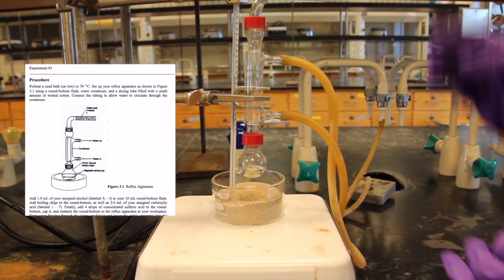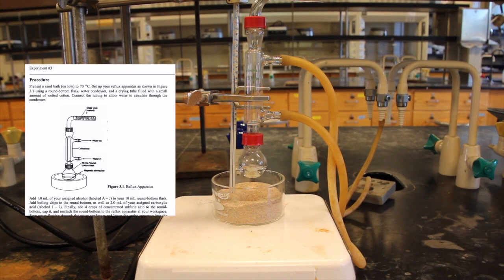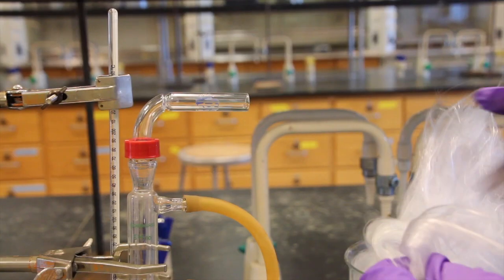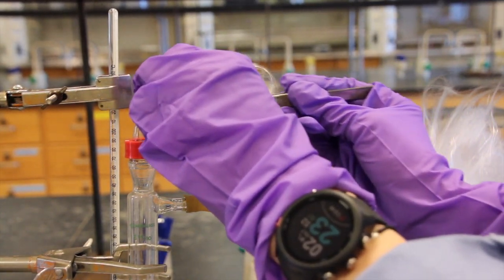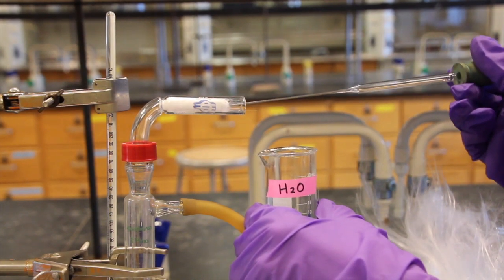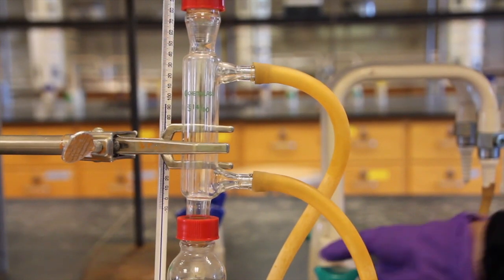To begin your synthesis, preheat a sand bath to 70 degrees Celsius. Set up your reflux apparatus as shown in your lab manual, using a round-bottom flask, water condenser, and a drying tube filled with a small amount of wetted cotton. Connect the tubing to allow water to circulate through the condenser.